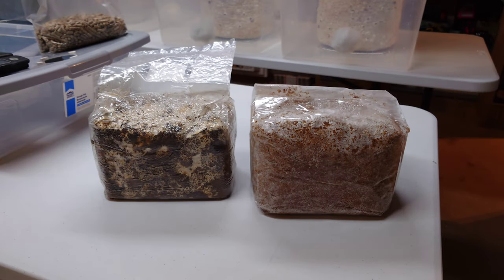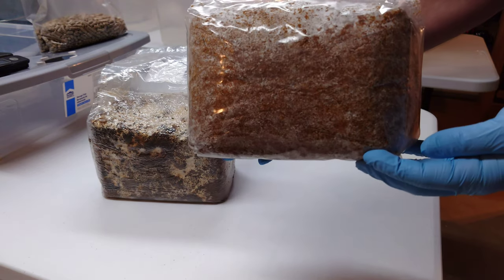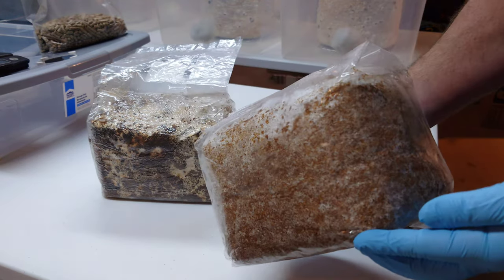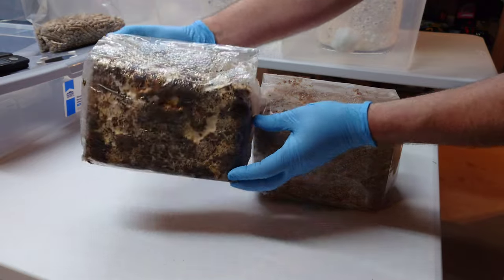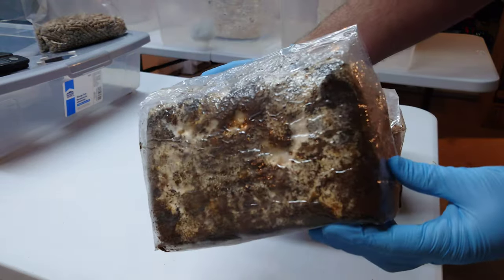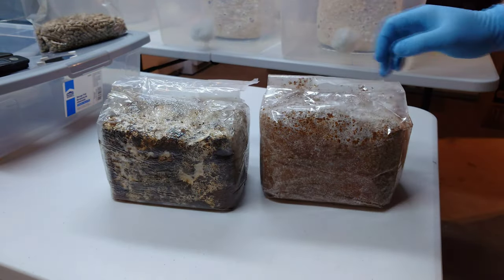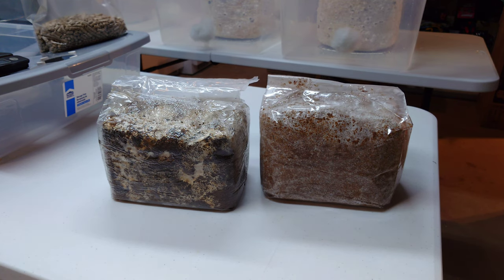Welcome back to the Mushroom Dungeon. In this video I'm going to show you how to use my simple in-bag hardwood fuel pellet pasteurization method to turn one bag of store-bought sawdust spawn into three bags. On the right I have some wine cap spawn (Stropharia) and on the left some bluet spawn. I purchased both bags from an online supplier — 5.5 pounds each — and we're going to turn each one into three.